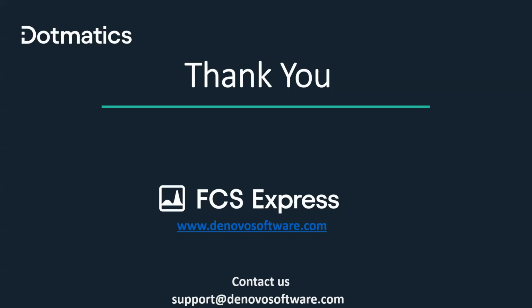I'm going to answer one more question. I saw one come through the chat last second here. It says, is there a tutorial to learn how to organize data to export into Prism? Yes, we have web resources, videos, written instructions, and tutorials. So I encourage you to go to the De Novo Software website, type in Prism in the search, and a lot of those materials are going to come together for you.